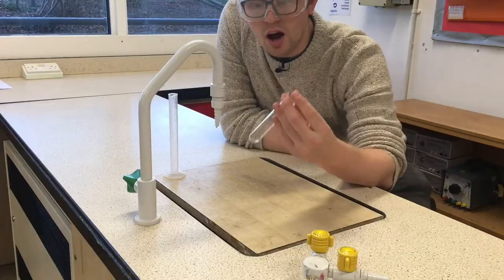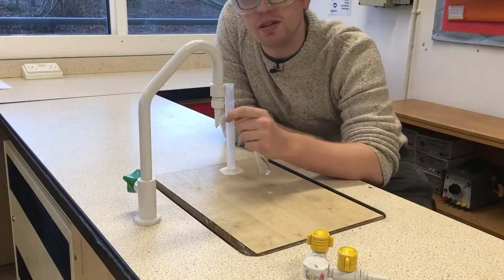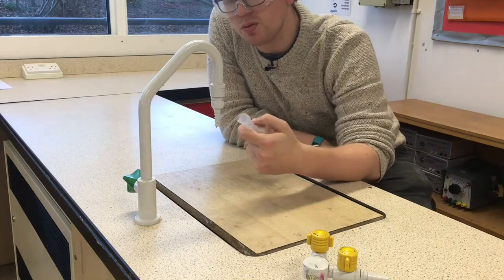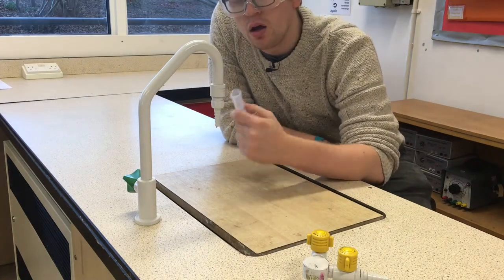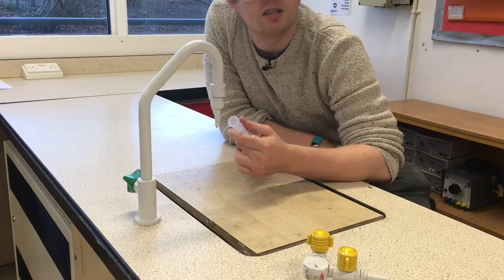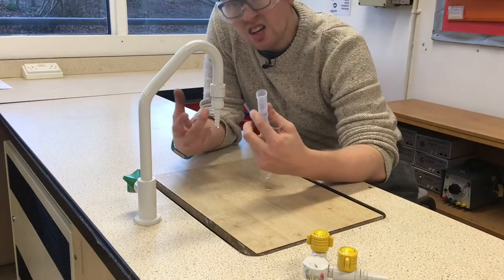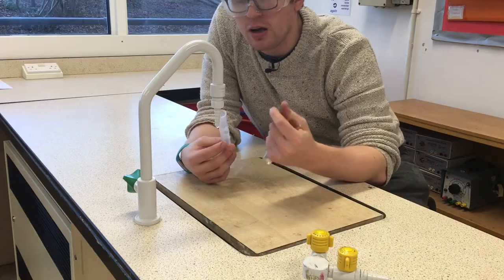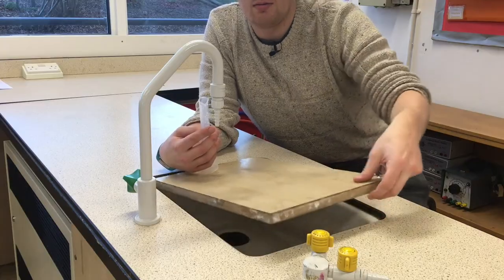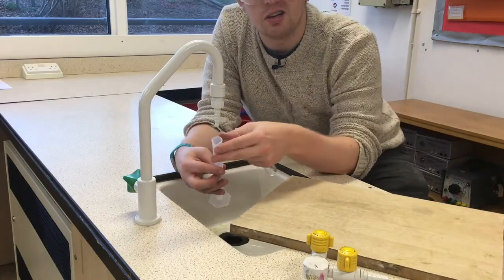Next I'm going to measure 20 centimeters cubed of water into each boiling tube. It's important we use the same amount because we want our test to be fair. Using the same volume is an example of a control variable — this is something we keep the same in each experiment in order for the results to make sense.